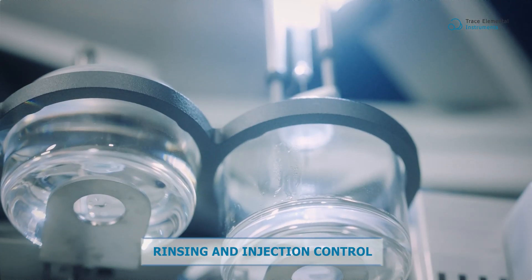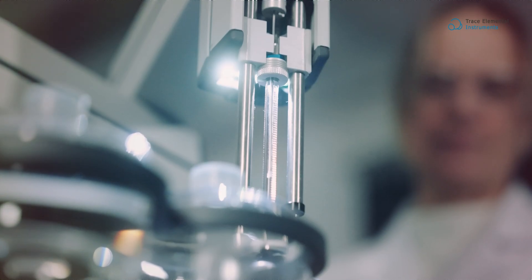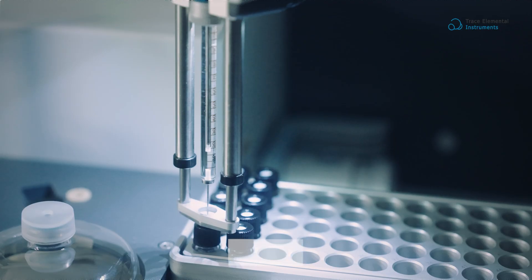Choose from various washing and injection programs to customize your application needs. Enjoy effortless injection monitoring with the convenience of an intuitive LED light.